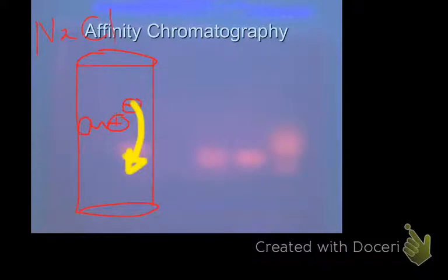That's why if it's a positively charged column, it's called an anion exchanger. Sometimes people get it mixed up. It's because they're exchanging anions. So the more negative proteins will bind, and you have to kick them off by increasing the amount of chloride, usually chloride anions or sulfate or something like that. But usually you want to use chloride, just because it's cheap, and it's also usually more stable. Proteins can usually handle it better. Sulfate sometimes precipitates out at a lower concentration than chloride does.